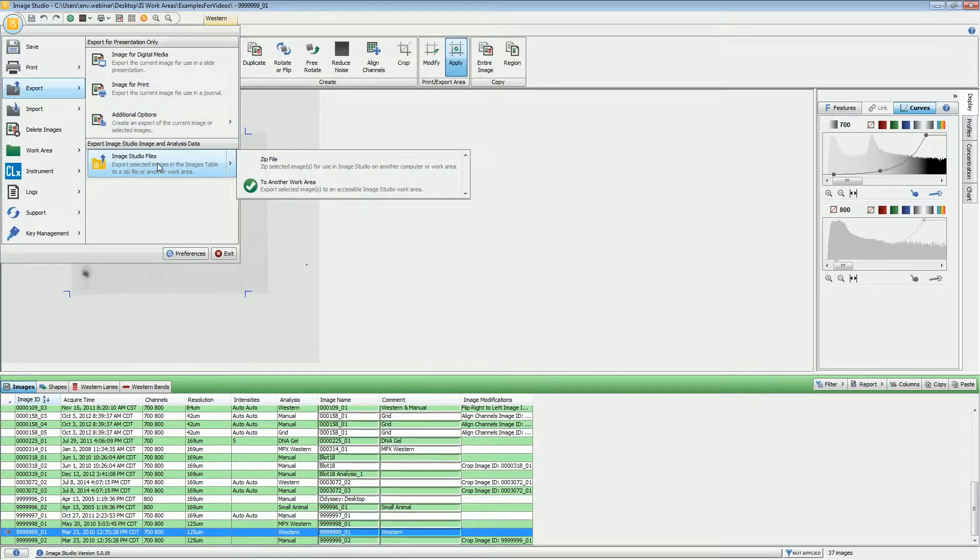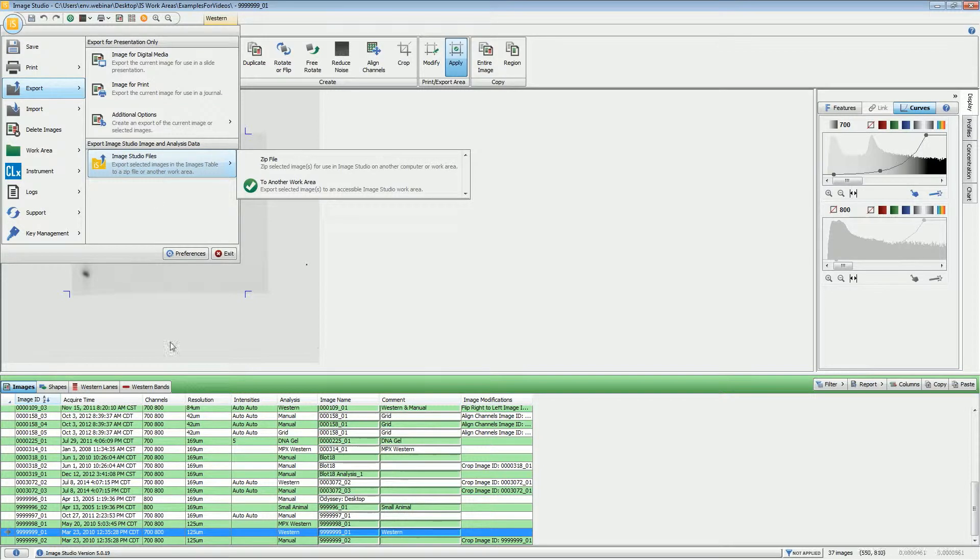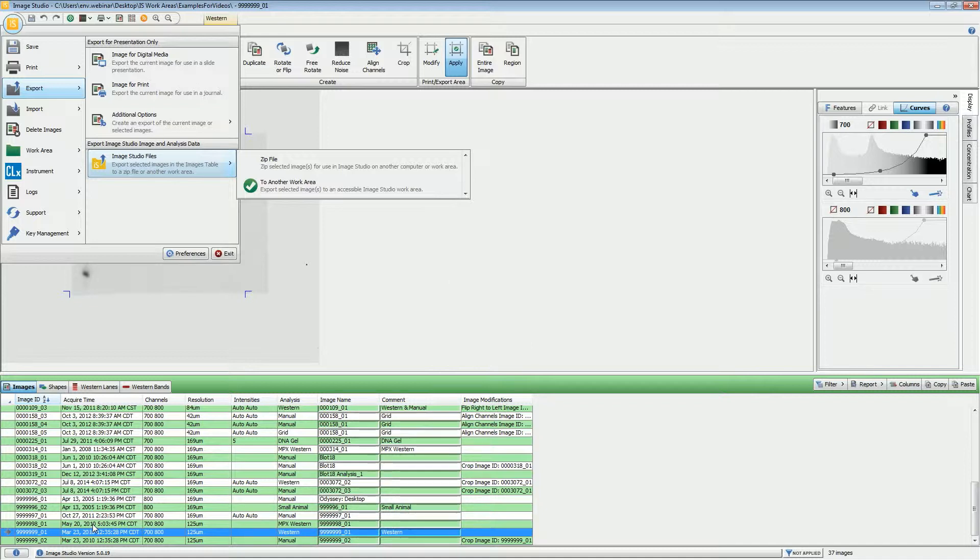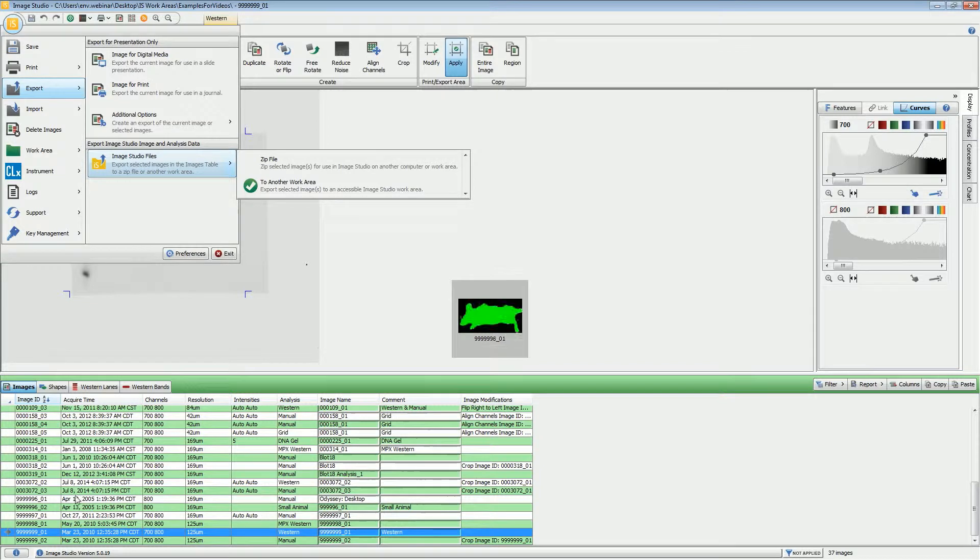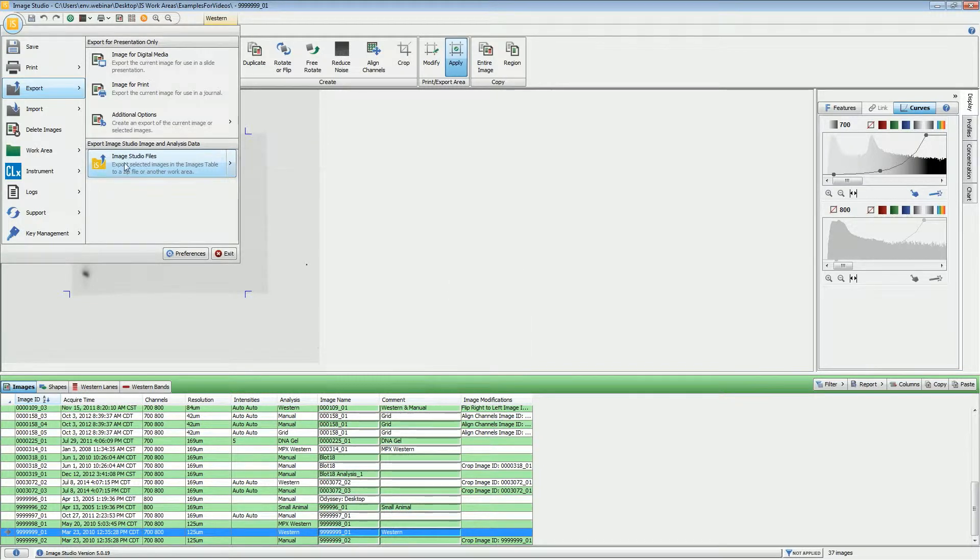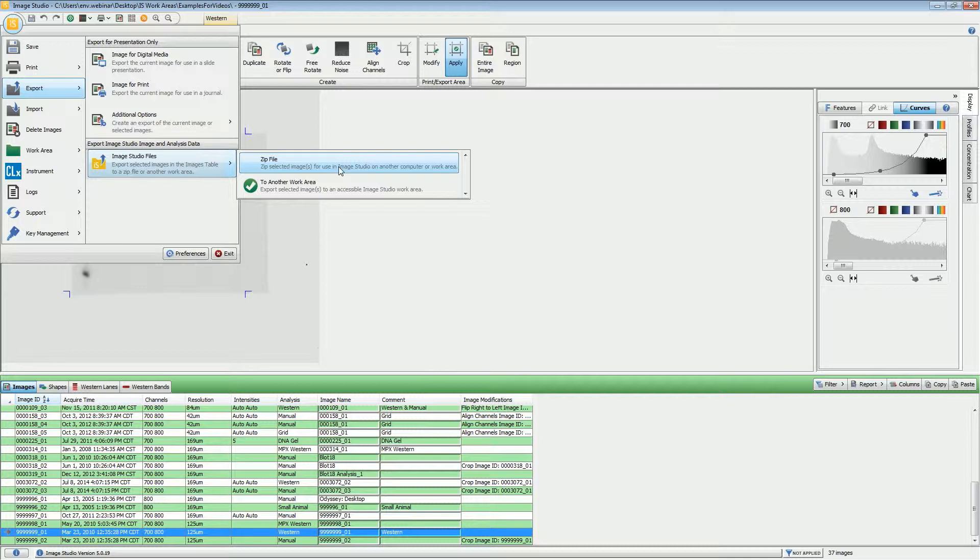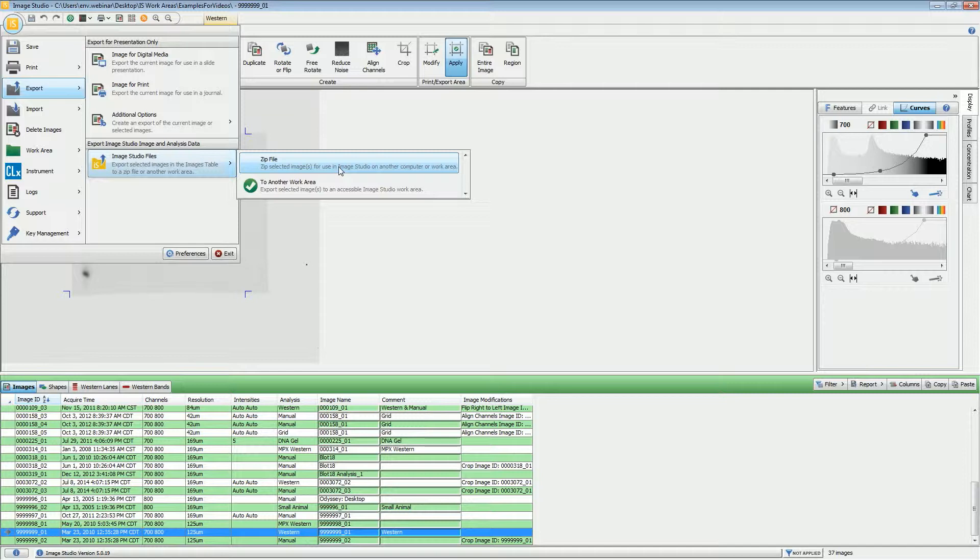Now, if you wish to move images from one work area to another, you choose this Image Studio Files button. If you wish to move the Image Studio acquisitions from one computer to another, highlight whichever images you wish to move and then choose Zip File. With that, it compresses all of the images into a single file which you can then save to either a network drive or a flash drive.